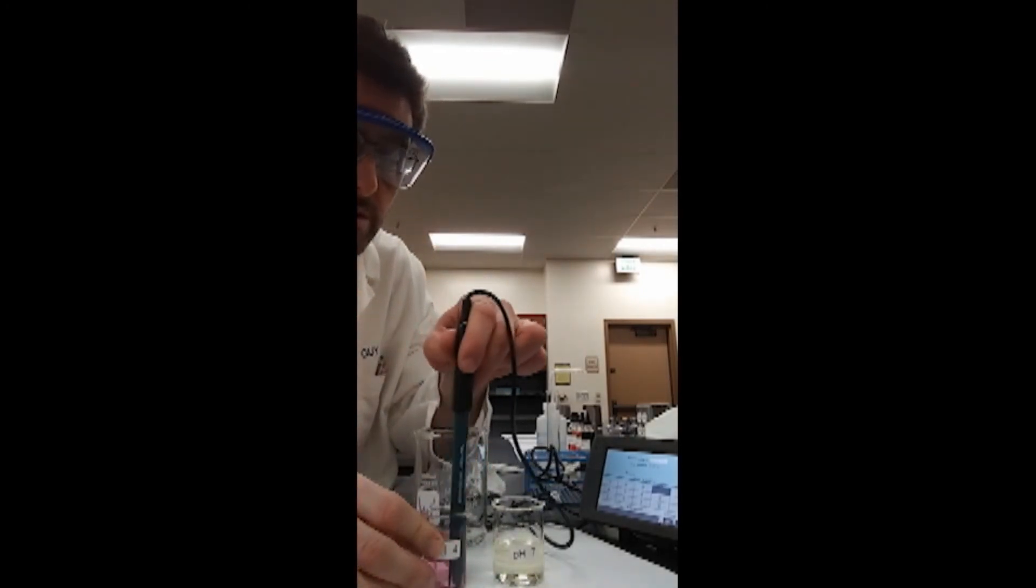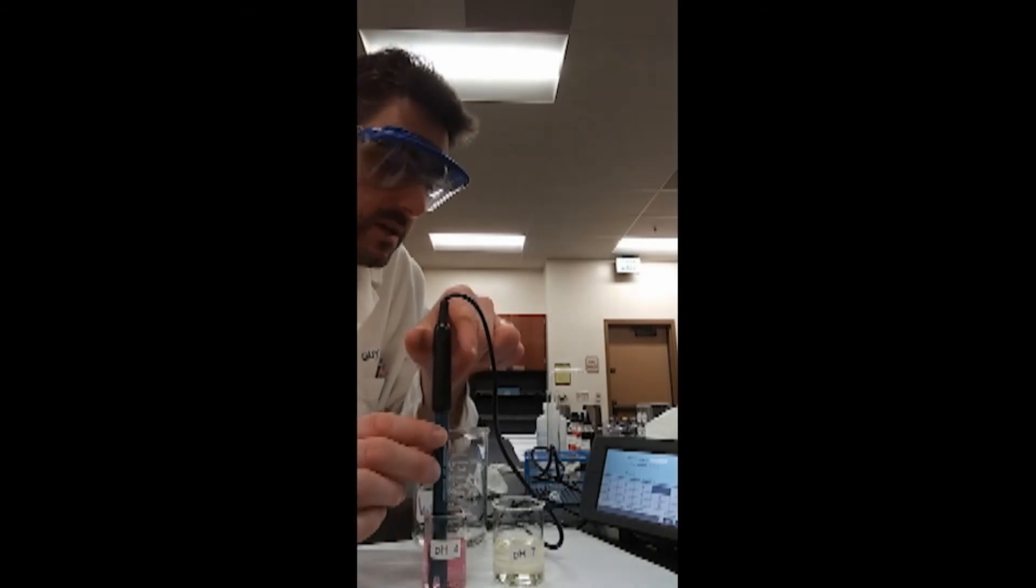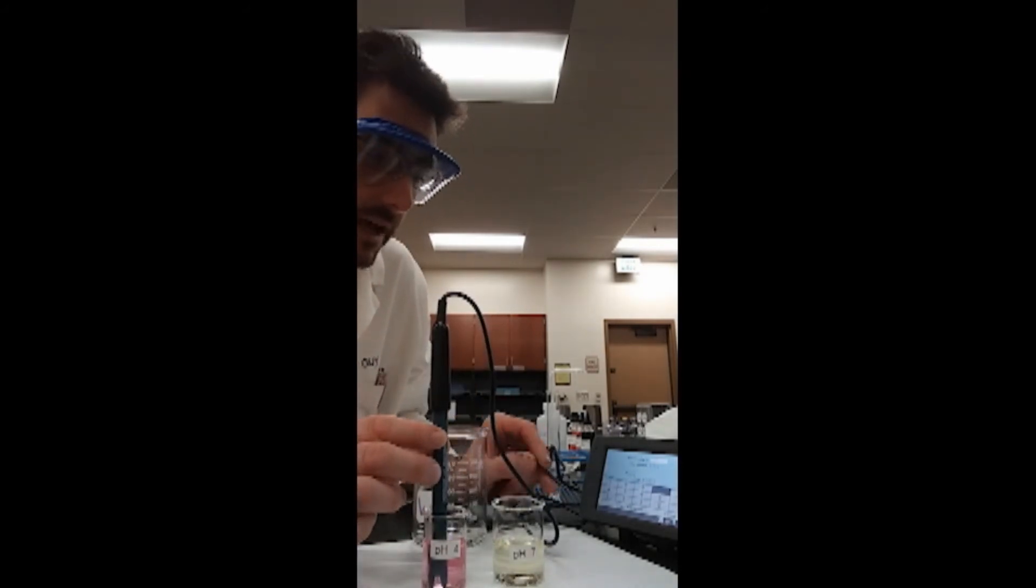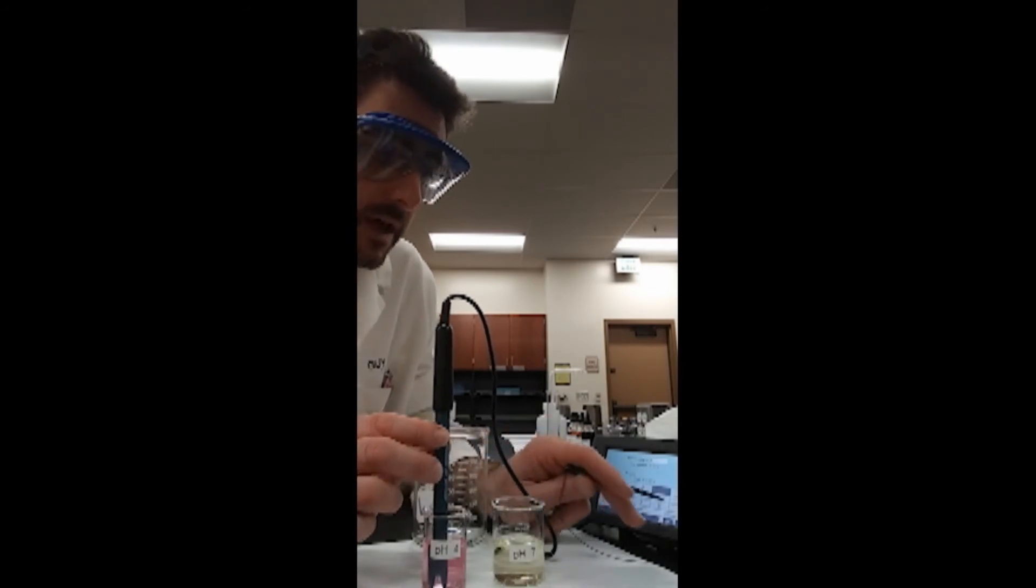I'll swirl, and again, wait for the millivolt voltage, which appears on the screen, to stabilize. At that point, I can type a pH value of 4, which represents the buffer's pH, and keep.